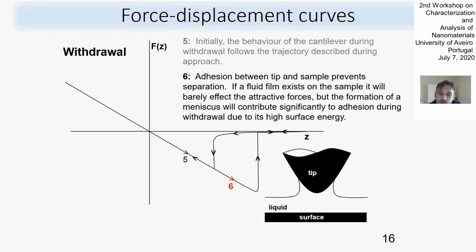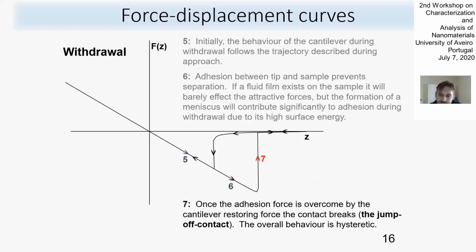layer at the surface, and this liquid layer creates an additional attractive force between tip and surface. When you move the tip, you don't feel this attractive force so much, but when you retract the tip, you will see that you have some force which plays against your applied force, and this really creates these hysteresis properties. And this is also very important because it allows us to measure not only the van der Waals forces, but also some forces connected with the properties of the nanoscale material which we study.